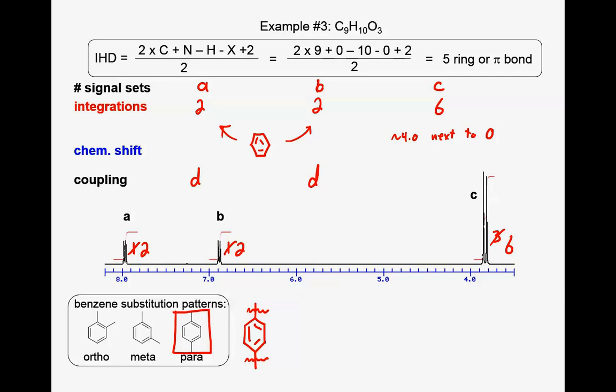Just throw a guess out there. Yeah, it looks like a doublet, right? All right, so we've got a doublet there. Let's think about if that makes sense. All right, so we've got 6 total protons. Can we stick 6 protons on 1 carbon?